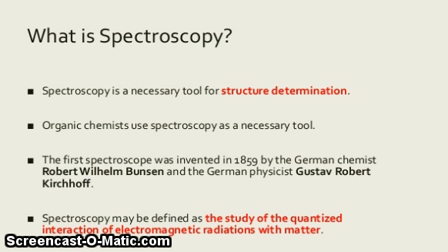Today in this video, I am going to talk about spectroscopy, especially UV visible spectroscopy. So what is spectroscopy? Spectroscopy is a necessary tool for structure determination. Organic chemistry uses spectroscopy as a necessary tool. The first spectroscope was invented in 1859 by a German chemist and German physicist. Spectroscopy may be defined as the study of the quantized interaction of electromagnetic radiation with matter.